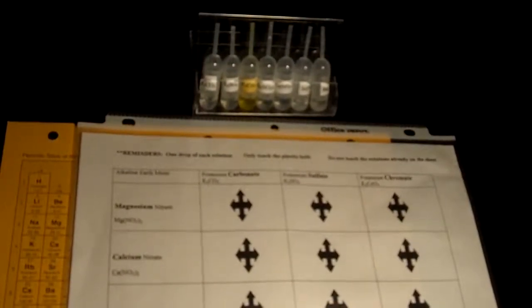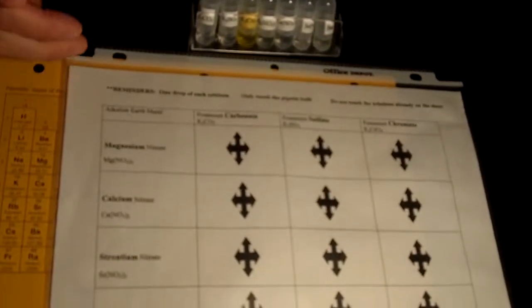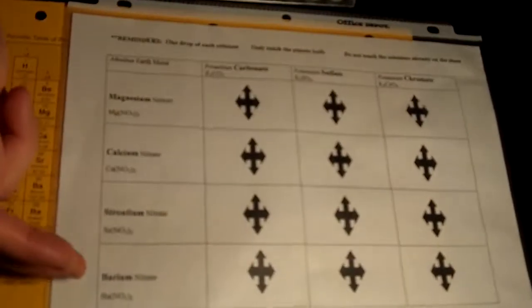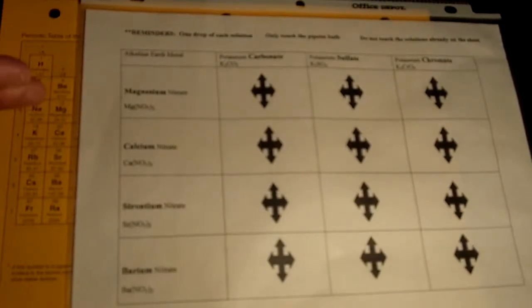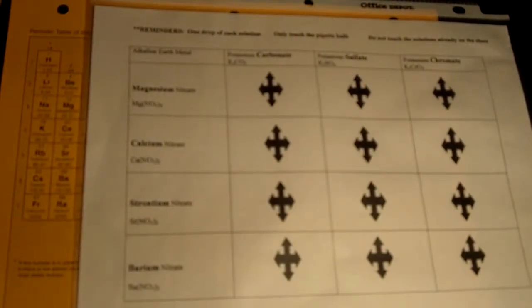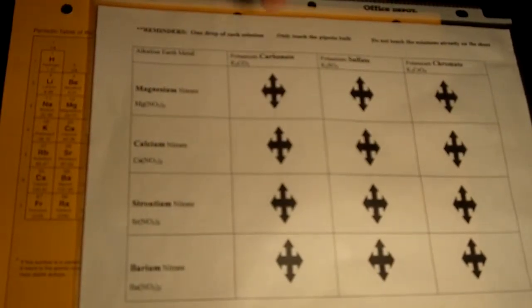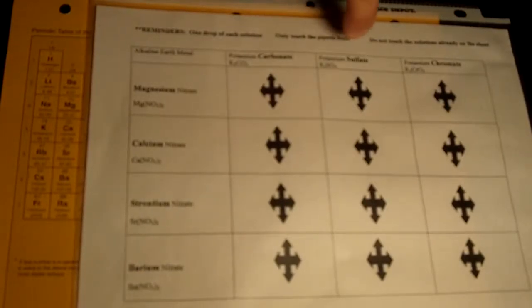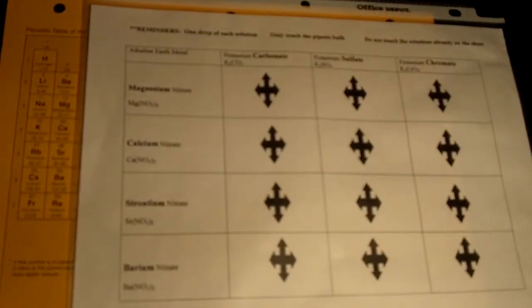The reactions will be executed on a small scale reaction surface, and that's the surface right here. We have the alkaline earth metal compounds down that particular first column, indicating the rows will have each of those, noting that we have magnesium, calcium, strontium, and barium in group 2 of the periodic table. Down each row we have potassium carbonate, potassium sulfate, and potassium chromate, each with the formulas as indicated in the data table on the second side of your lab.